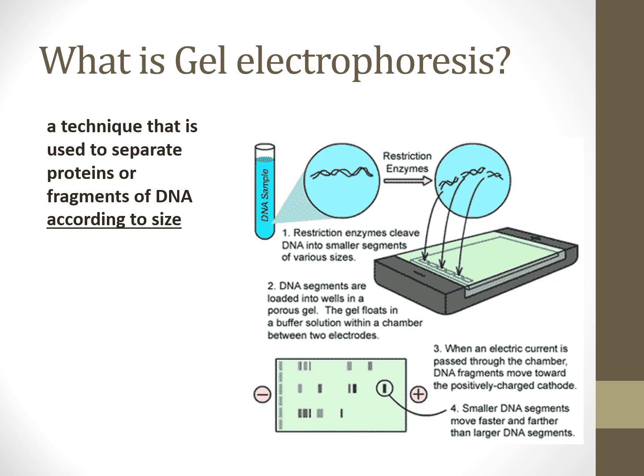And when we add DNA fragments to that maze, we can separate them due to size because small pieces of DNA are able to travel more quickly through the gel compared to larger fragments of DNA. So we're going to have a little look to see how that happens today.